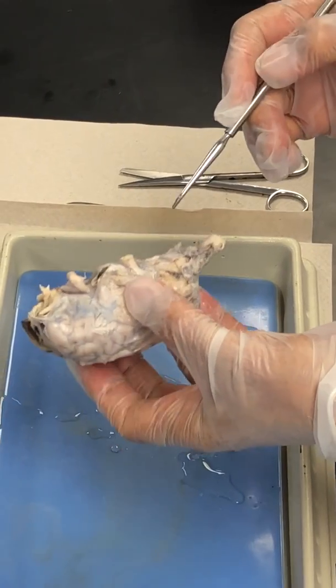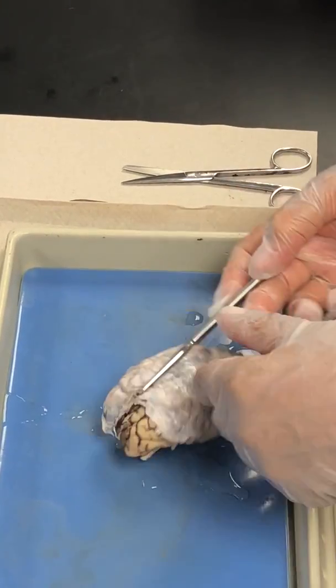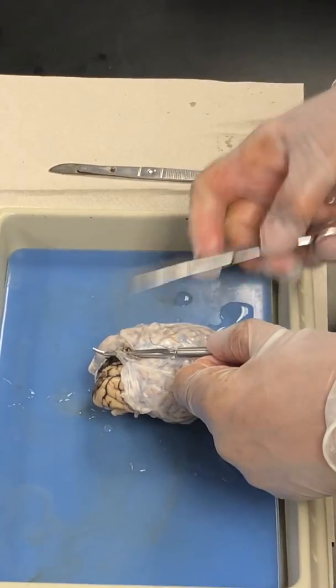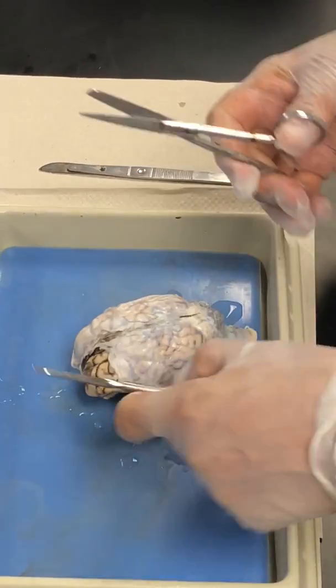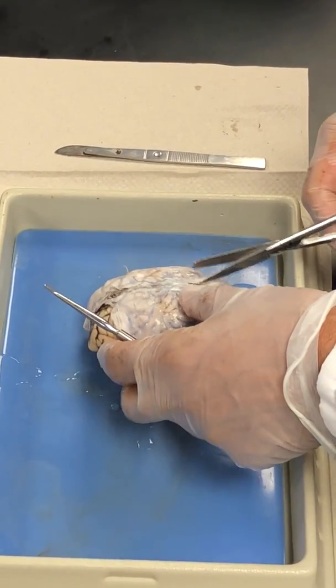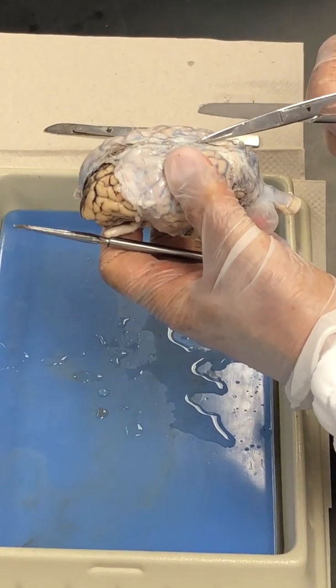So what I'm going to do next is I'm going to remove the meninges, and that's a little bit challenging. So I'm going to use the scissors, try to cut through this without damaging the brain.